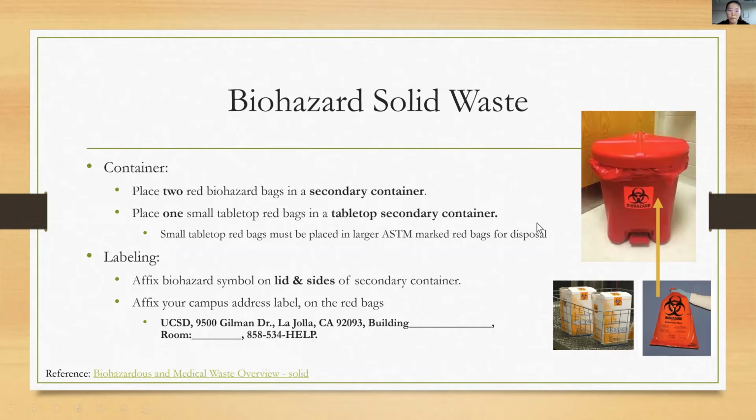Did I make it clear how to treat the biohazard contaminated tips and tubes? Because we actually have some problems with how to properly dispose of the biohazard tips. So please make sure that they are in a secondary container, and also that they are disposed of in the red bag.